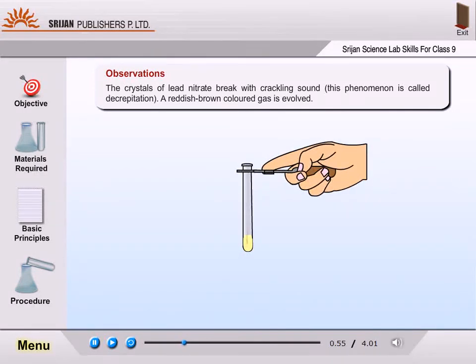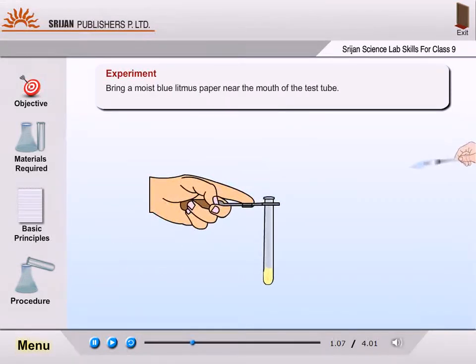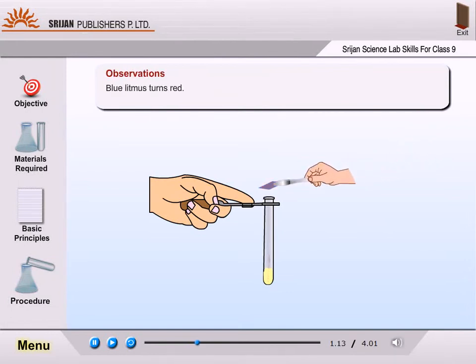The reddish brown colored gas is evolved. The evolved gas contains nitrogen dioxide gas. Bring a moist blue litmus paper near the mouth of the test tube. Blue litmus turns red.